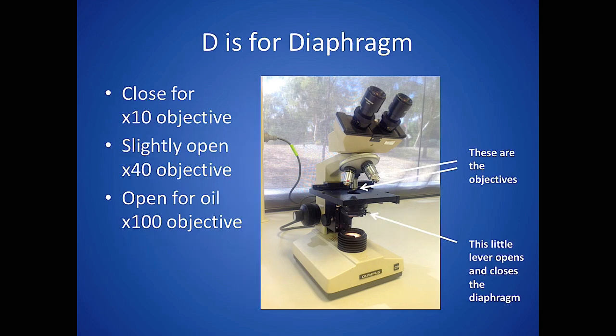D is for diaphragm. Look very carefully at the condenser unit and you can see a tiny lever that can slide to an open and closed position for the diaphragm inside the condenser. When starting off with a 10x objective, have the diaphragm closed. When you move to the 40x objective, have it slightly open, and if you're using an oil objective for oil immersion microscopy, you'll need it all the way open.